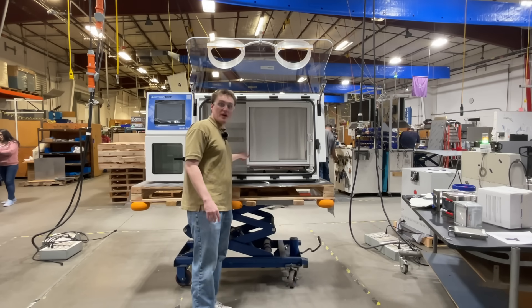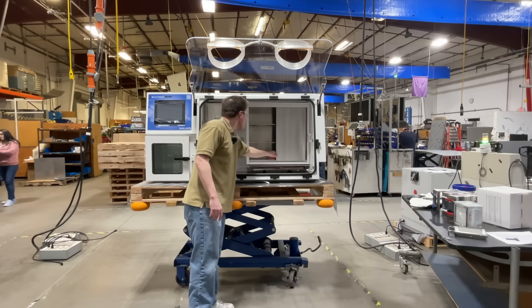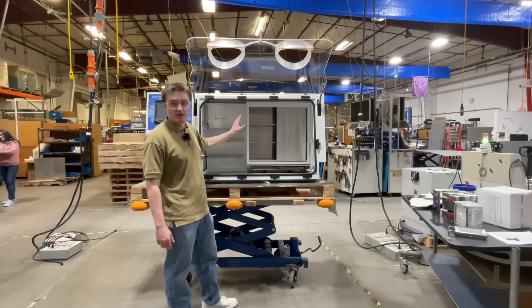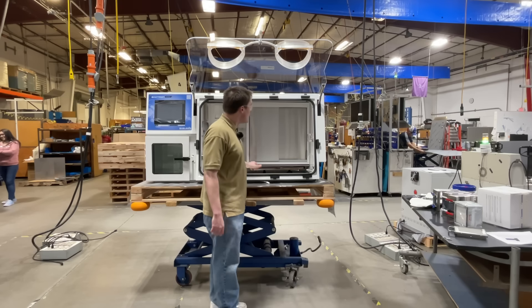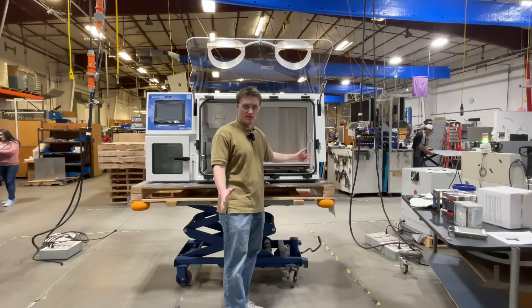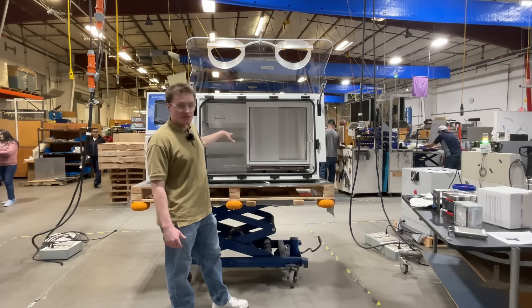Coming over here, we have our incubator. It features easy slide doors and three shelves. This has enough capacity for 400 standard size petri dishes. Coming over here, we have our manometer assembly, similar to the other Bactron line. It helps keep a half inch of water pressure inside the unit.